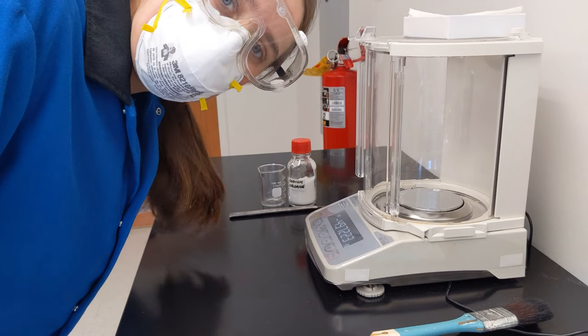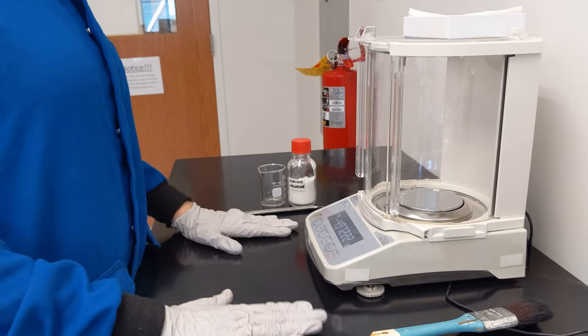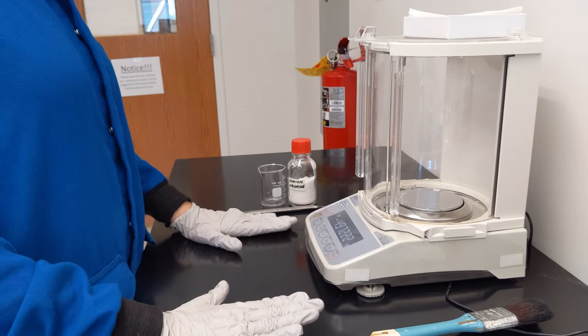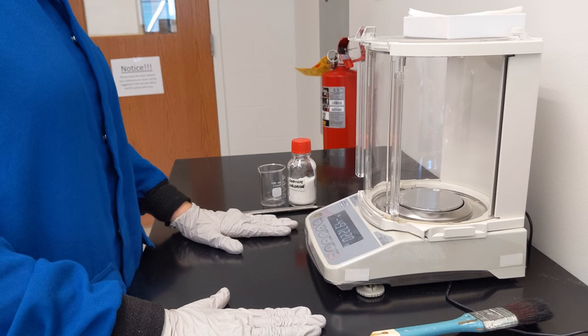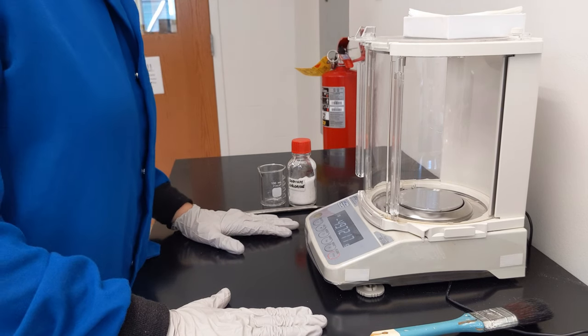This is how to use and clean an analytical balance. The very first thing you need to do is make sure that it's clean, because you don't want your sample contaminated and you don't want the mass of any mess to change your reading.